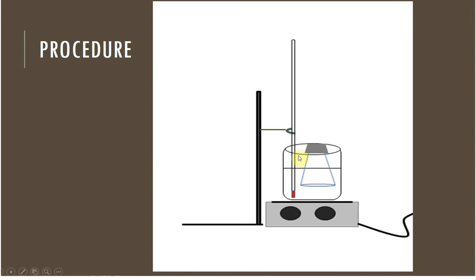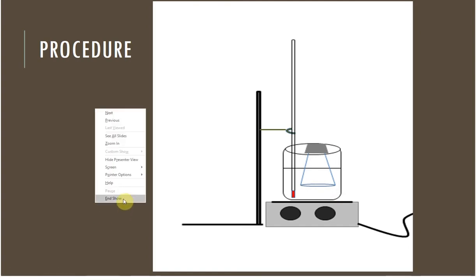Now, the procedure tells you to add some boiling stones. That's really just to keep from having big bubbles and bumping around on the hot plate. So you have your water bath heating up. And once that's heating, you go and get your flask ready. Now your flask, just like all other Erlenmeyer flasks, is going to be just a flask.